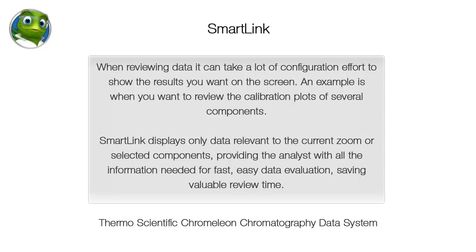When reviewing data it can take a lot of configuration effort to show the results you want on the screen. An example is when you want to review the calibration plots of several components.